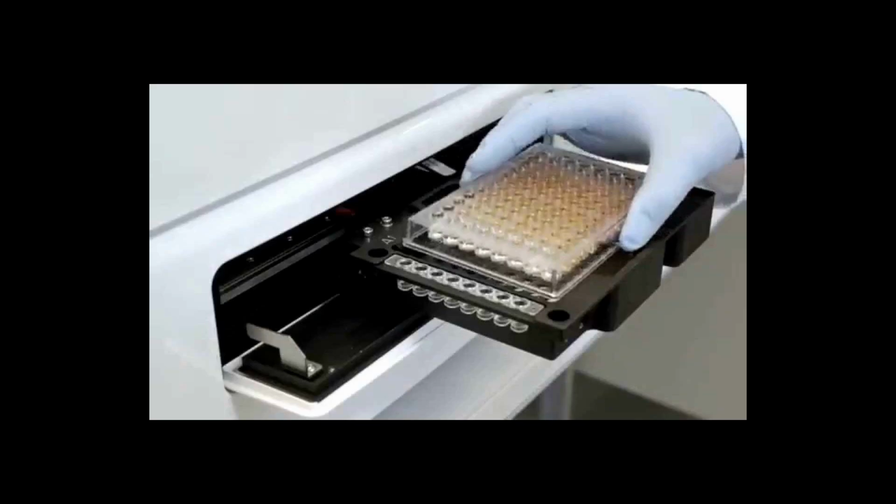Several conventional colorimetric analyses have been miniaturized to function quantitatively in a plate reader, with performance suitable for research purposes. Examples of analyses converted to plate reader methods include several for ammonium, nitrate, nitrite, urea, iron, and orthophosphate. More recent colorimetric chemistries have been developed directly for use in plate readers.